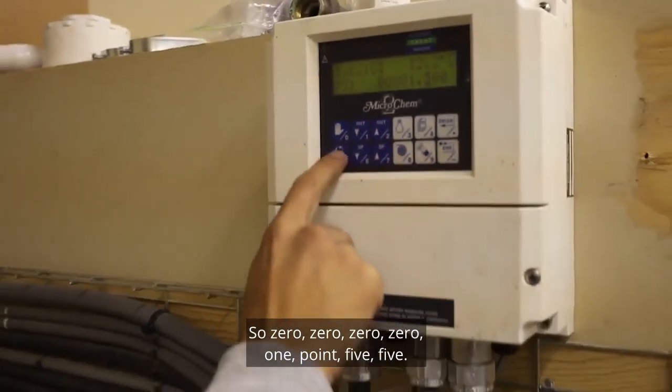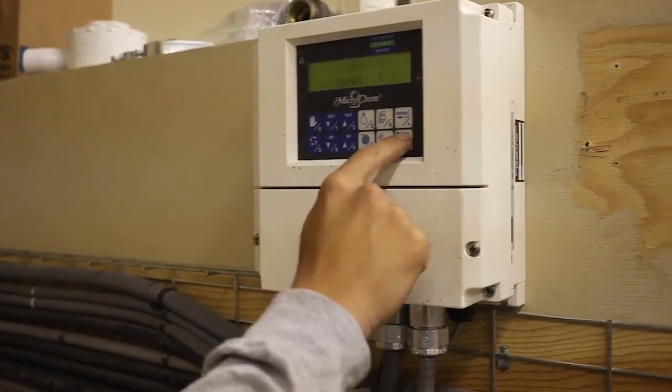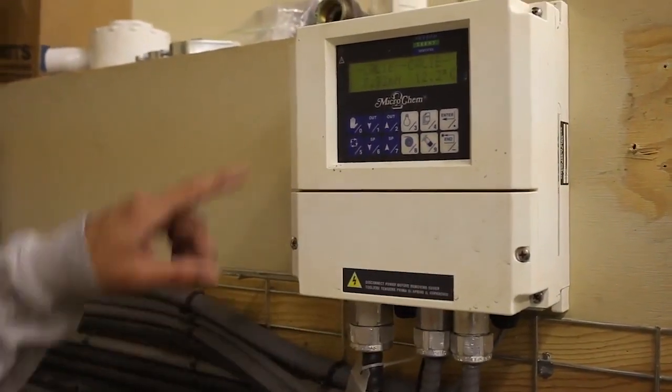Then you put in the value it came up as — 1.55. Press Enter, then N, then select Calibrate and press Enter.